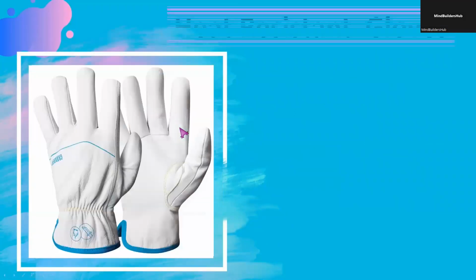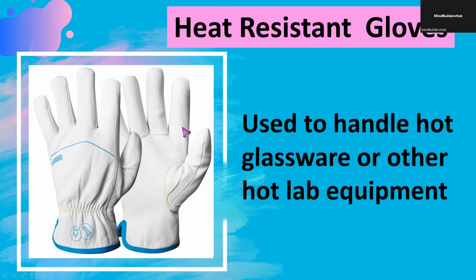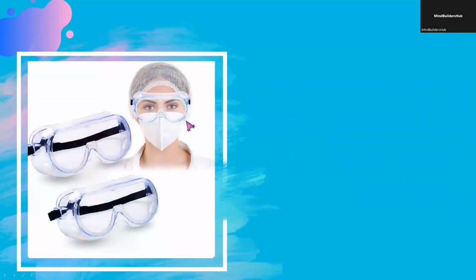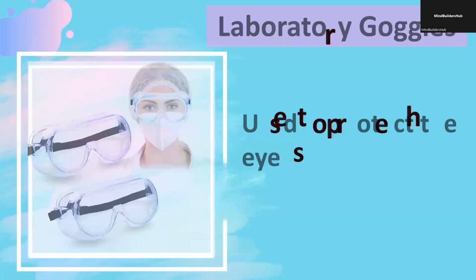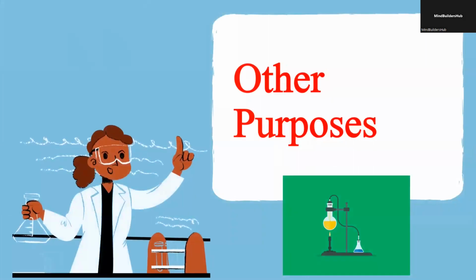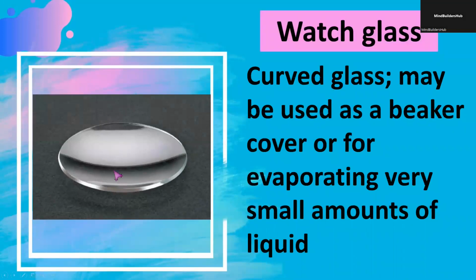Aside from the laboratory gown, you may use also the heat-resistant gloves because you're dealing with heat, so therefore, it is used to handle hot glassware or other hot laboratory equipment. You may also wear the laboratory goggles used to protect your eyes. And for some other purposes, we have this instrument. This is called the watch glass because it is used to cover the beaker. And if you want to evaporate a small amount of liquid, you may also use this watch glass.